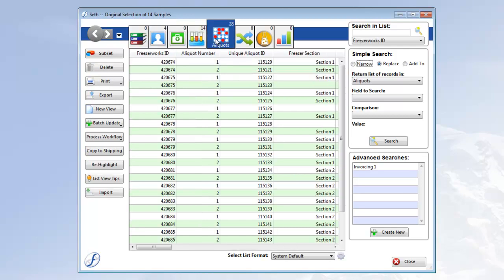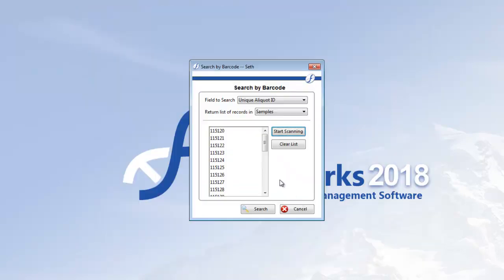When I'm done working with the selection, I click close, and I'm returned to the search by barcode tool, where I can click clear list and scan another batch of barcodes.